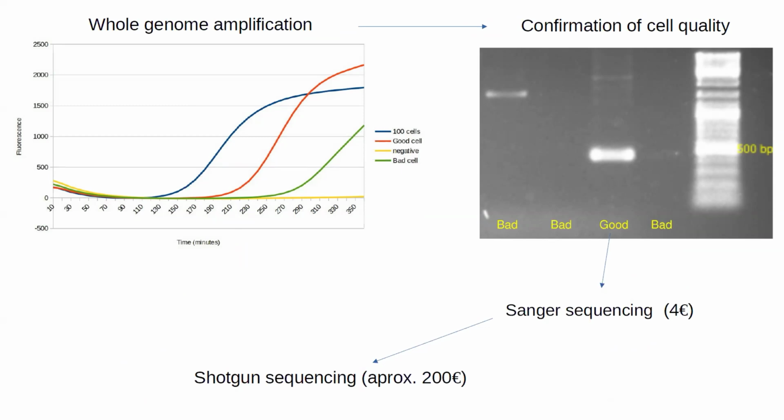If you have some experience with Illumina sequencing, you can do some multiplexing, for example combining 96 samples in one plate. But of course, you don't want to risk it, because each individual sample costs quite a lot of money. So sometimes we did some double checking before sending samples for sequencing, even small checks by amplification of the 16S gene, to make sure that what we see as an amplified curve is actually a real bacterial genome, because it could be just a piece of bacterial DNA that is amplifying a lot. That would result in a lot of money wasted on sequencing non-existent genomes.